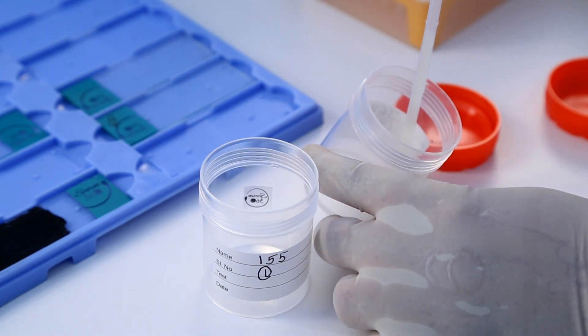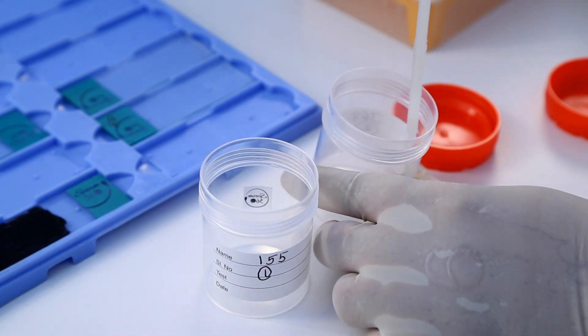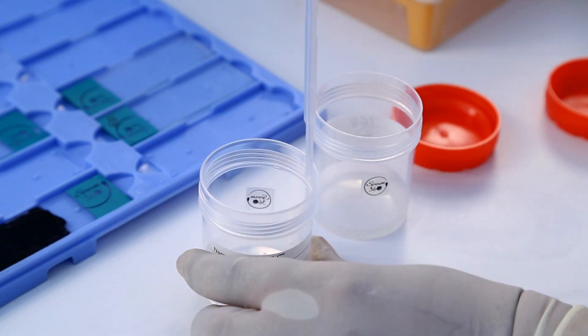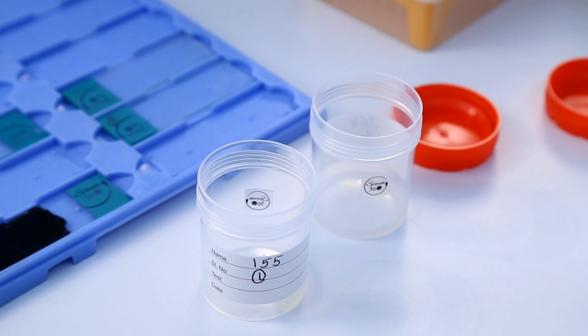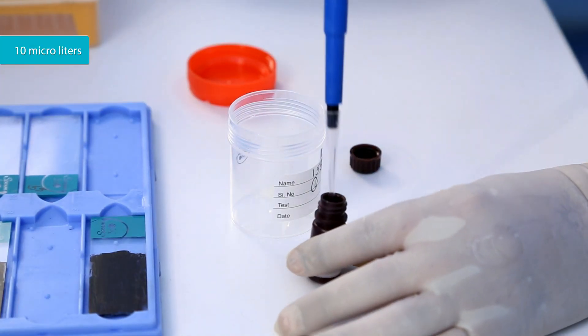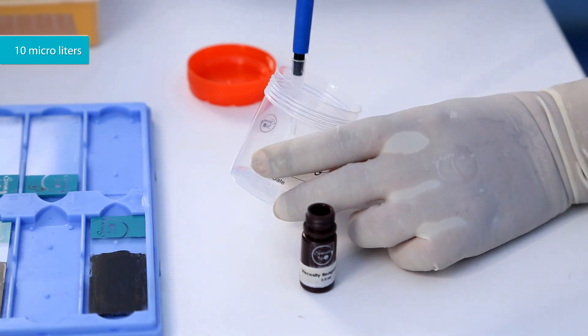Measure the approximate volume of hyperviscous semen. Put 1 ml of semen sample into the container with ID. Add 10 microliters per ml of viscosity reagent to the semen sample.